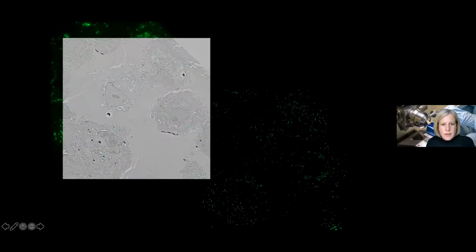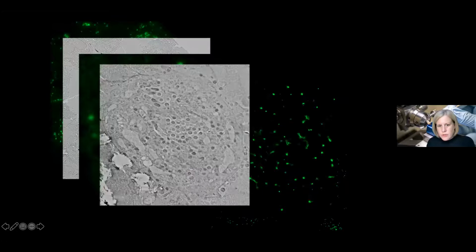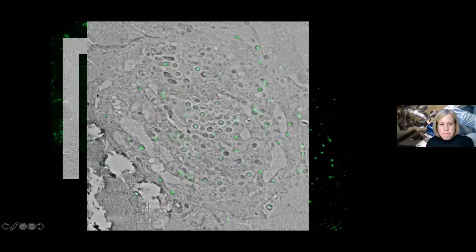And again, looking at lower magnification, each of these is a cell with virus particles. This is the super resolution light microscopy reconstruction. Then we switch directly to EM and do the overlay. We can zoom in, so wide field, super resolution, EM, and overlay. And you can see now that the signal is shrunk right down to the core of the virus particles, which are about 250 nanometers in diameter. And with Susan Cox, we did some calculations, and we think we have a localization precision of around 80 nanometers. And in the future, we'll be aiming for around 50 nanometers cubed, 15 nanometers kind of voxel accuracy.